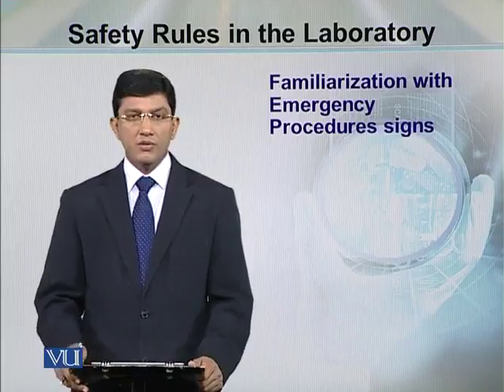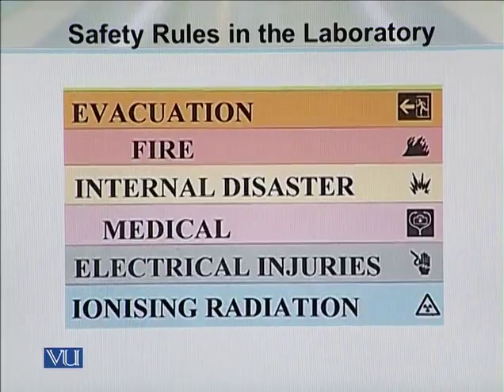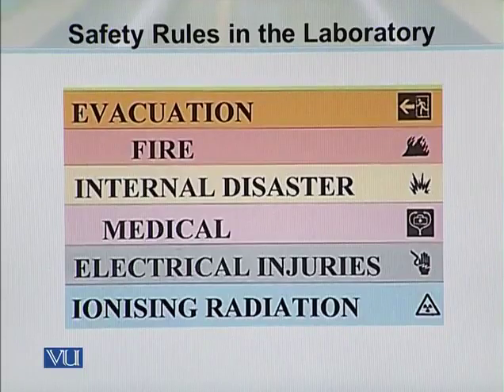Besides these things, you need to learn about some signposts which are normally hanged or labeled in the laboratories or in the scientific buildings. You need to understand what a particular signpost means. What does this means, or where is the evacuation gates? Where is the medical supply or first aid box located? This particular room is fixed or is reserved to work with the ionizing radiations. These symbols or signposts are quite common in the laboratories.